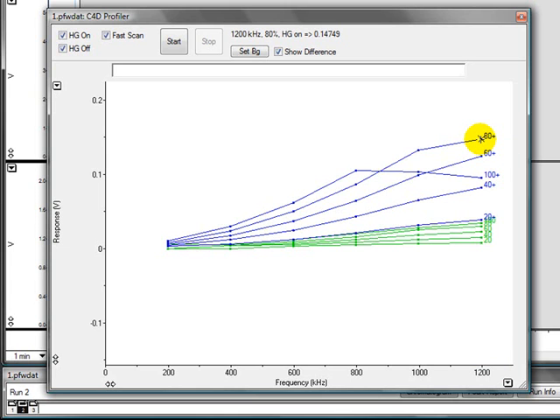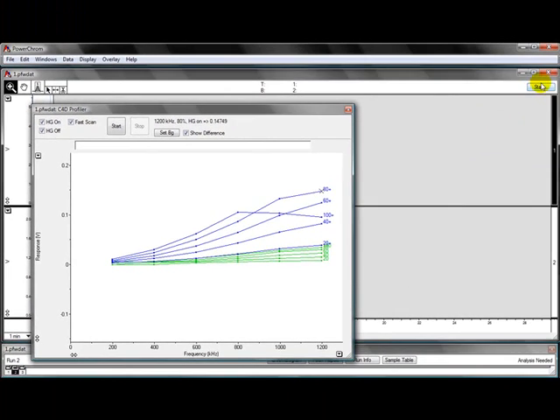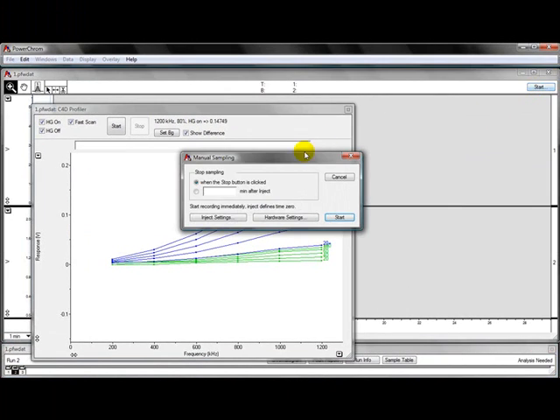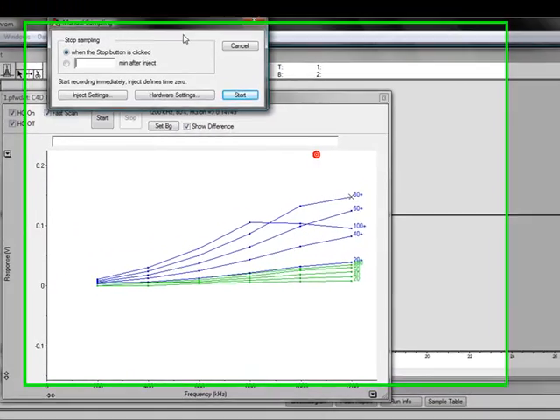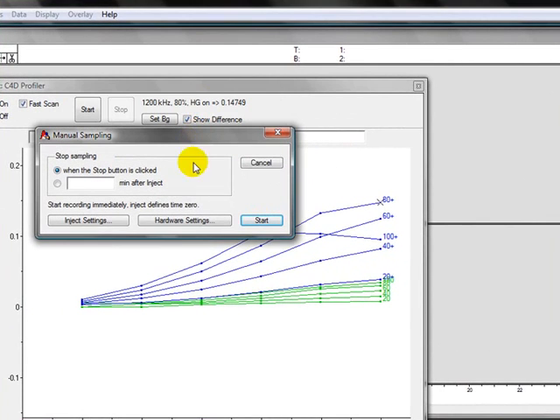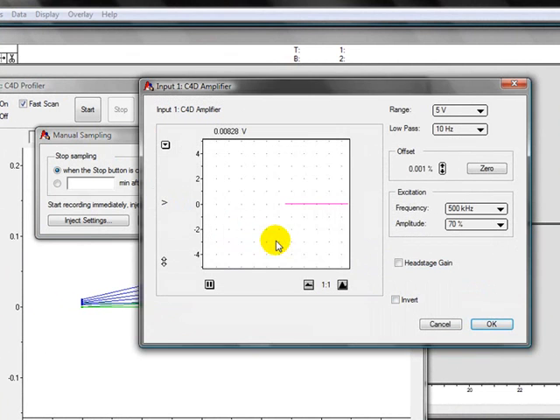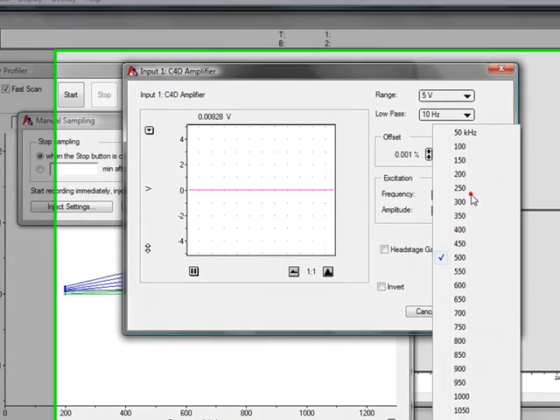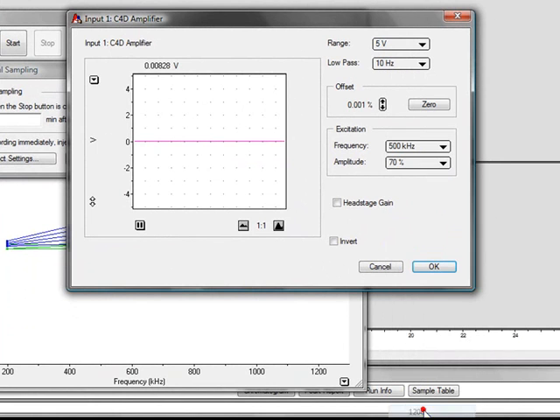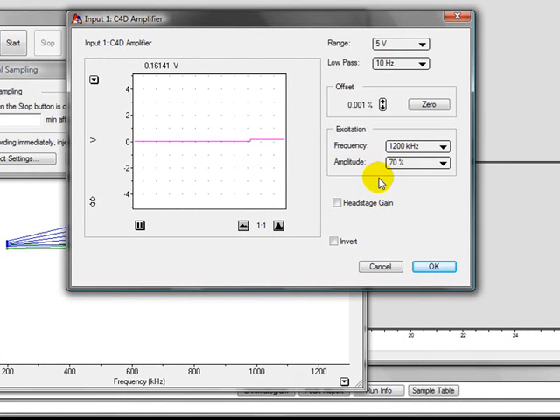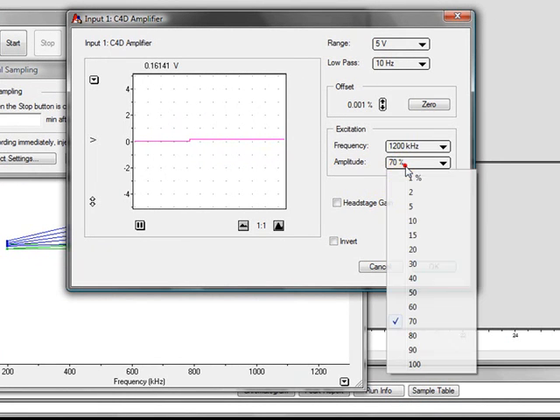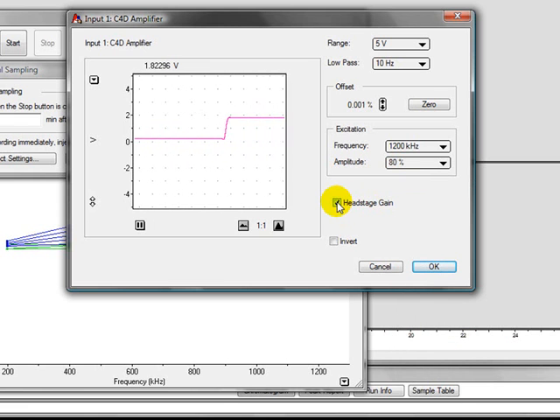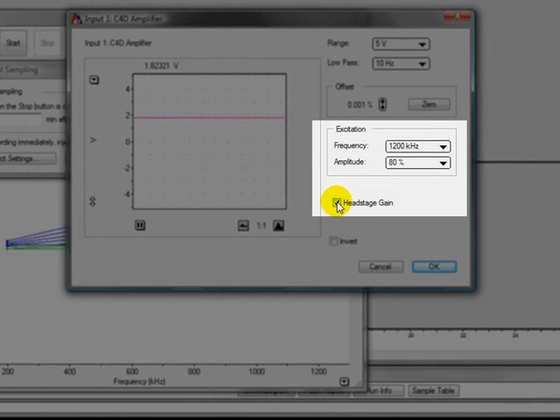These values should be entered into the C4D window. You should click on Start, Hardware settings, C4D amplifier. In here, the frequency you choose 1200 kHz, the amplitude should be 80% with the head stage gain on. These are the settings you should use for your experiments.